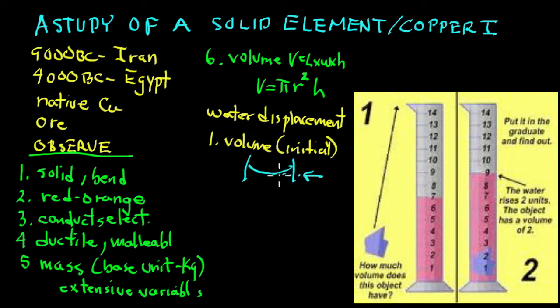Because it curves. It's called a meniscus. M-E-N-I-S-C-U-S. Meniscus.